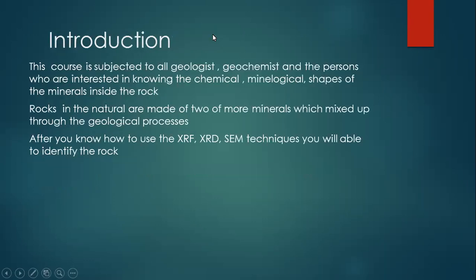So before we talk about the XRD, the XRF, and the scanning electron microscope, we shall give more introduction about this course. This course is aimed at all the geologists, all the geochemists, and all the people who are interested in knowing the chemical and mineralogical makeup and the shape of the minerals inside the rocks, because in this case, you will have a full description of the rocks that you're dealing with.